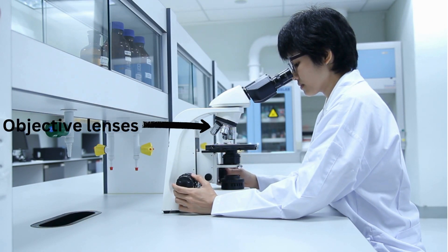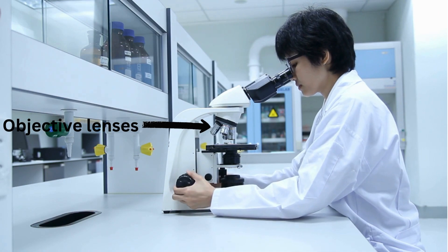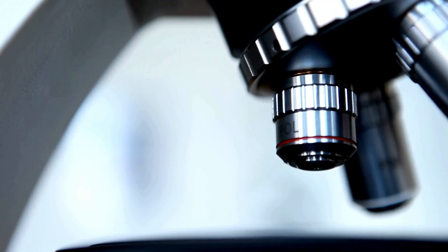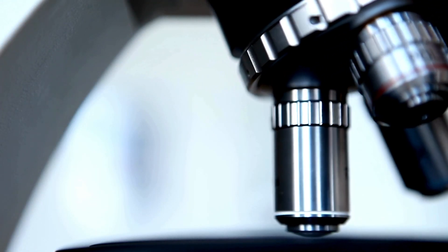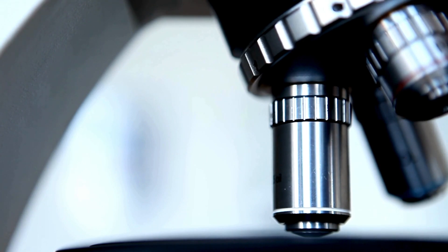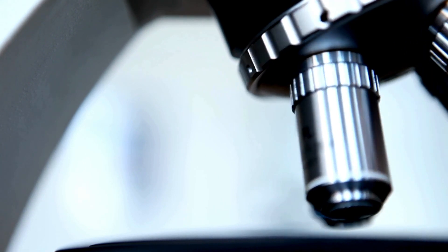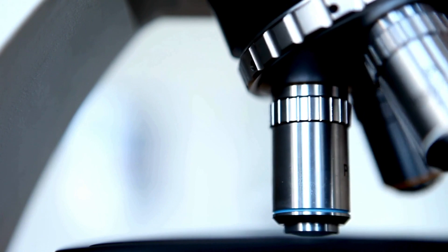Objective lenses. Objective lenses are located on a rotating turret near the nosepiece. They come in various magnifications such as 4x, 10x, 40x, and 100x. The user can switch between these lenses to achieve different levels of magnification.